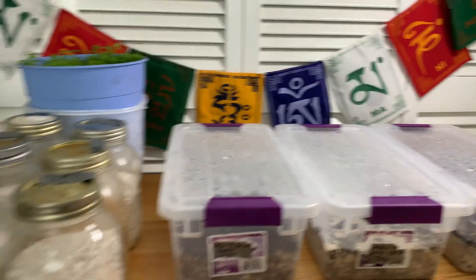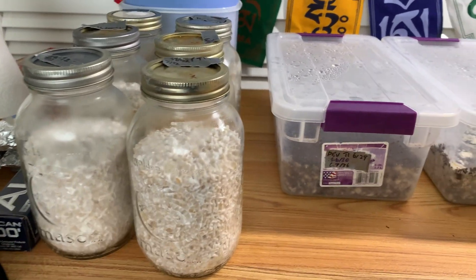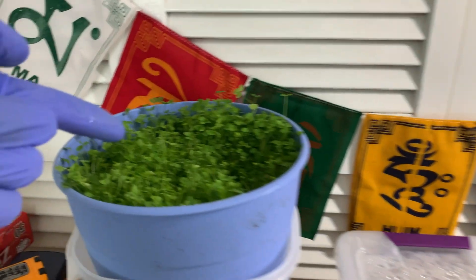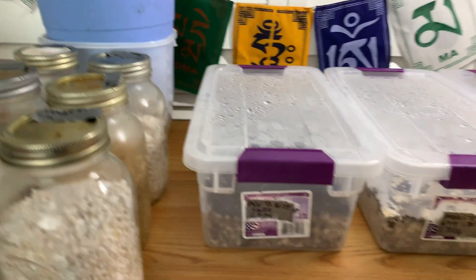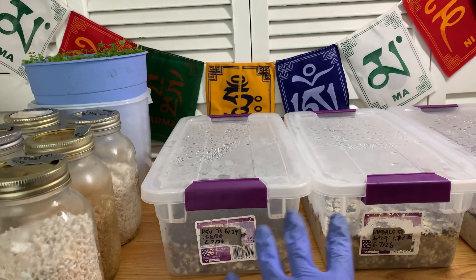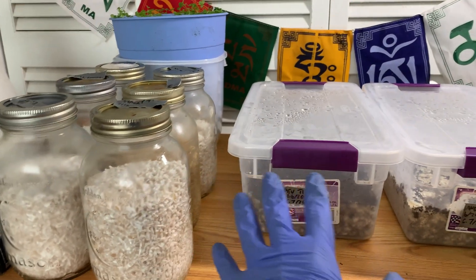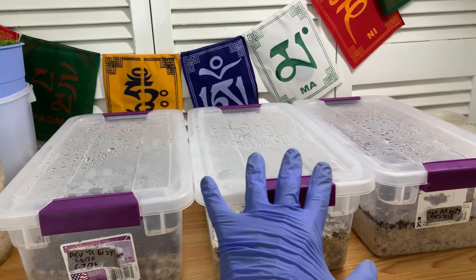These guys have been in the fridge for three weeks or more - in the case of the spawn jars, they've been in there for about a month. I'm going to give you an update on everything: how they're doing, are they contaminated, that kind of thing, and also the experiment I did with these substrates and shoe boxes.